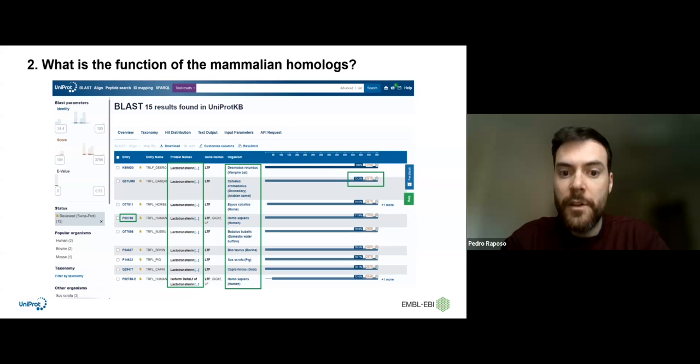Also, note that you can see the details on each alignment. At the right side of each one, you have 3 values. The first one being the identity percentage. The second one is the score, and the third one is the alignment e-value.